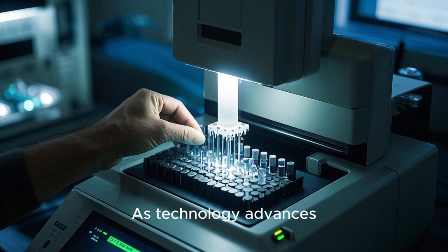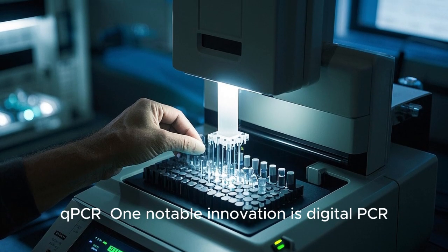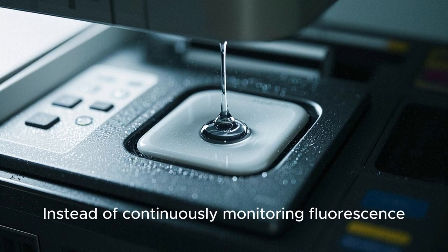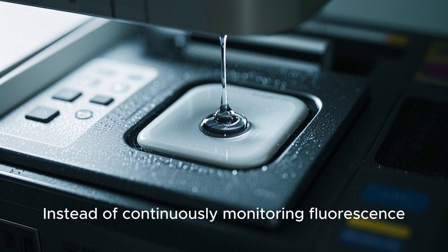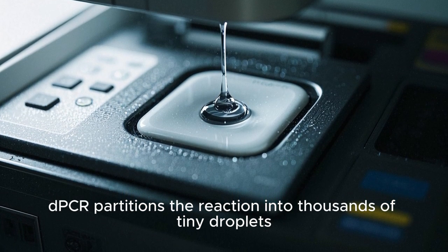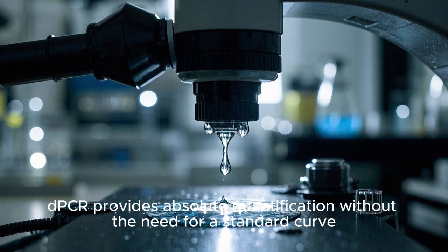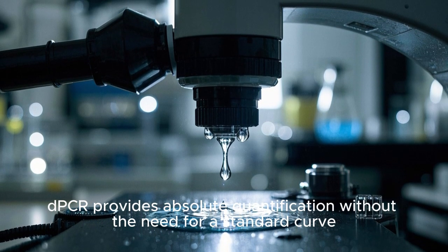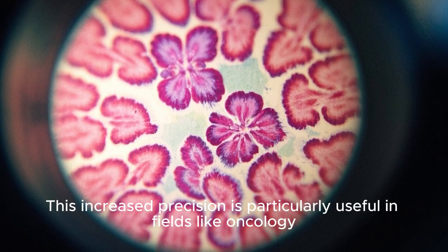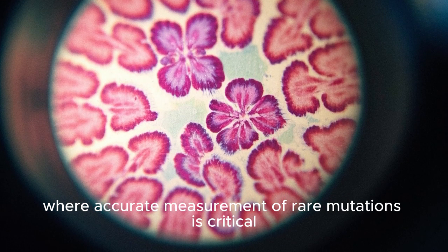As technology advances, exciting developments continue to push the boundaries of qPCR. One notable innovation is digital PCR, dPCR. Instead of continuously monitoring fluorescence, dPCR partitions the reaction into thousands of tiny droplets. By analyzing the distribution of positive and negative droplets, dPCR provides absolute quantification without the need for a standard curve. This increased precision is particularly useful in fields like oncology, where accurate measurement of rare mutations is critical.